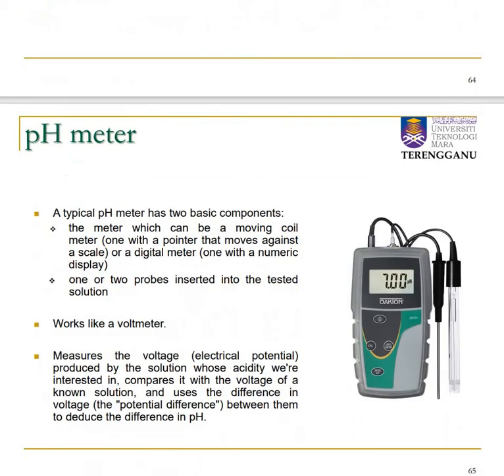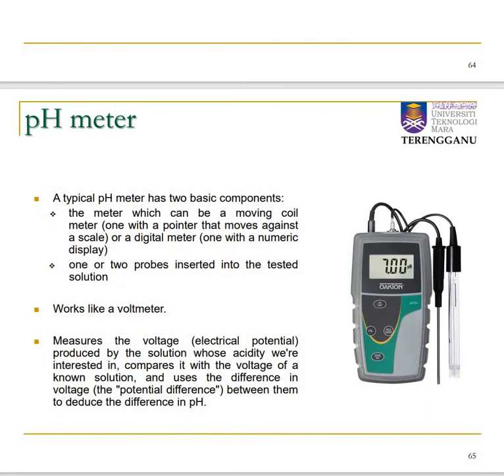Okay, so this is a common pH meter that will normally be used inside the R&D lab, in a laboratory, in small scale production, or in a testing lab.